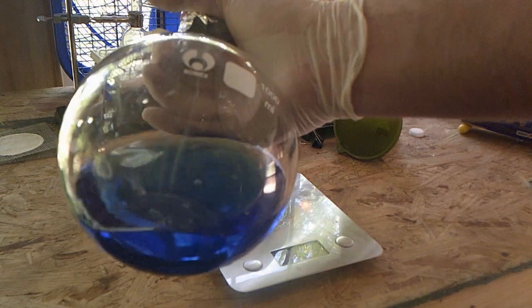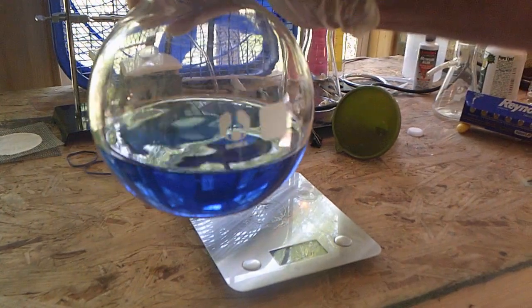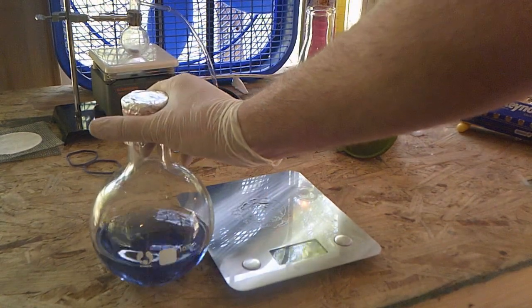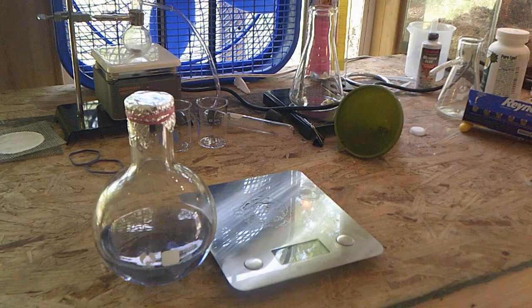So this is why the methylene blue was blue when I pulled it out of the bottle. Obviously, right, there's oxygen in the atmosphere. So methylene blue is usually blue. But in the presence of this base and the sugar, we can take methylene blue from being blue and turn it into colorless by doing that redox reaction. And there it goes, back to clear.